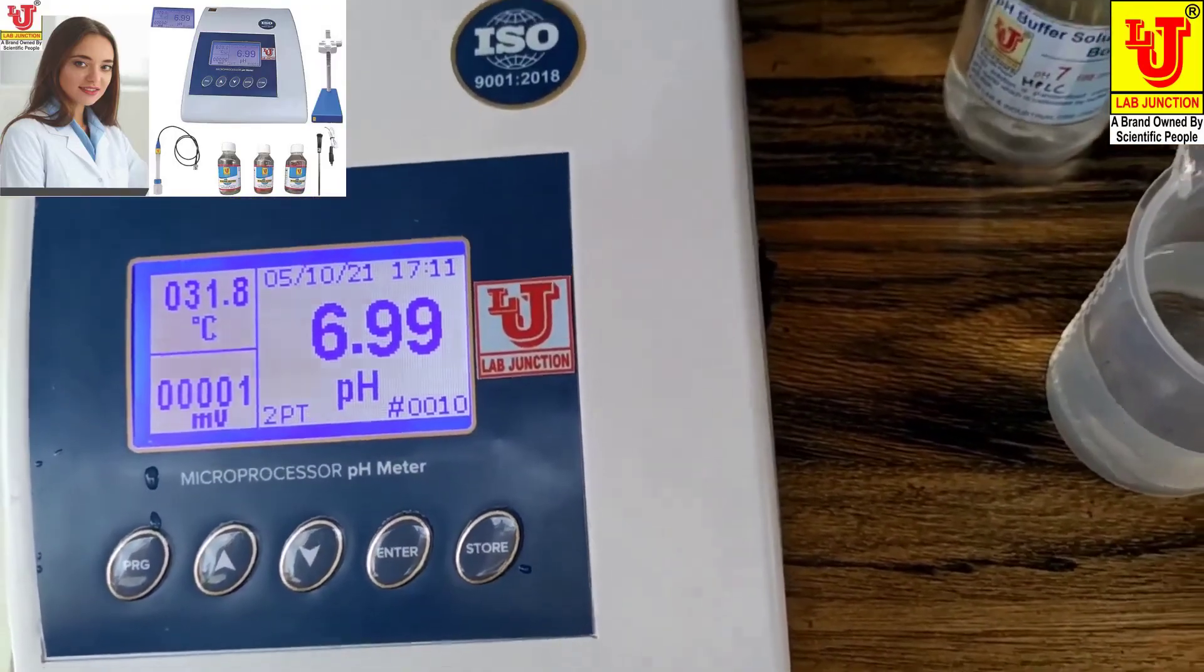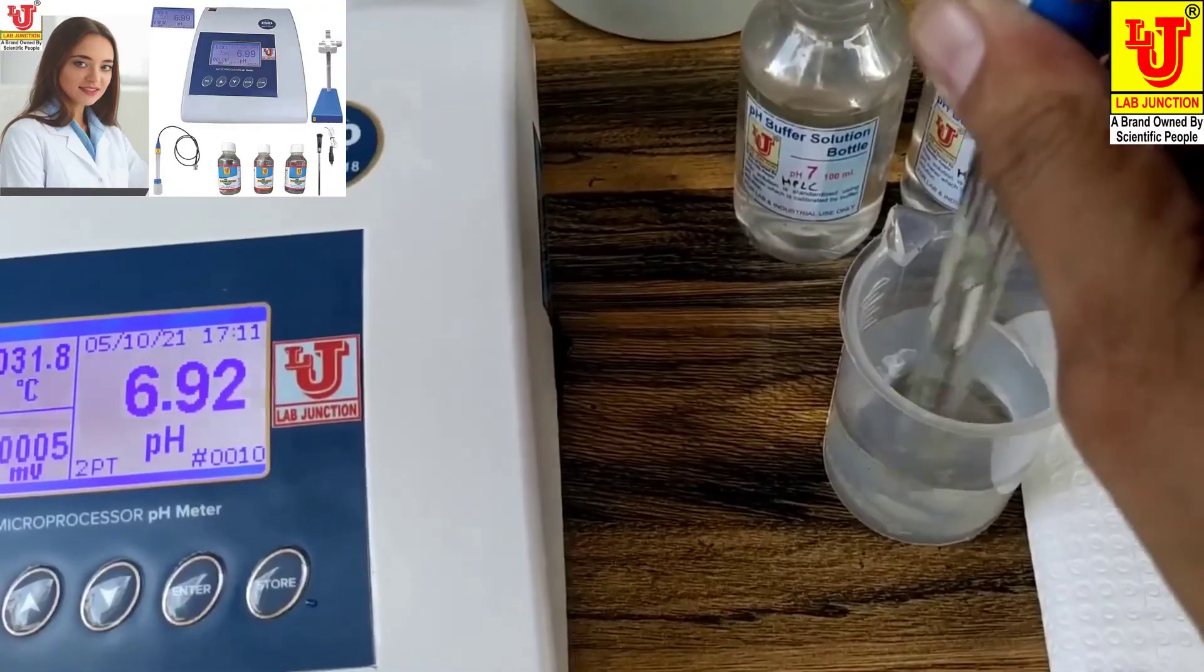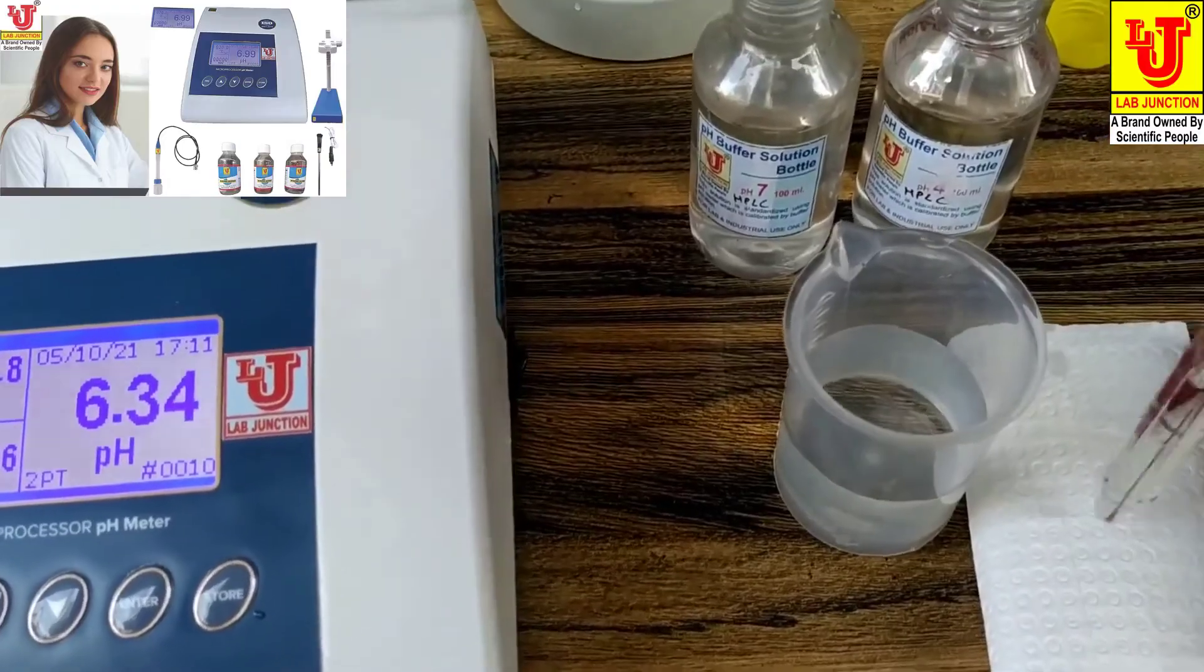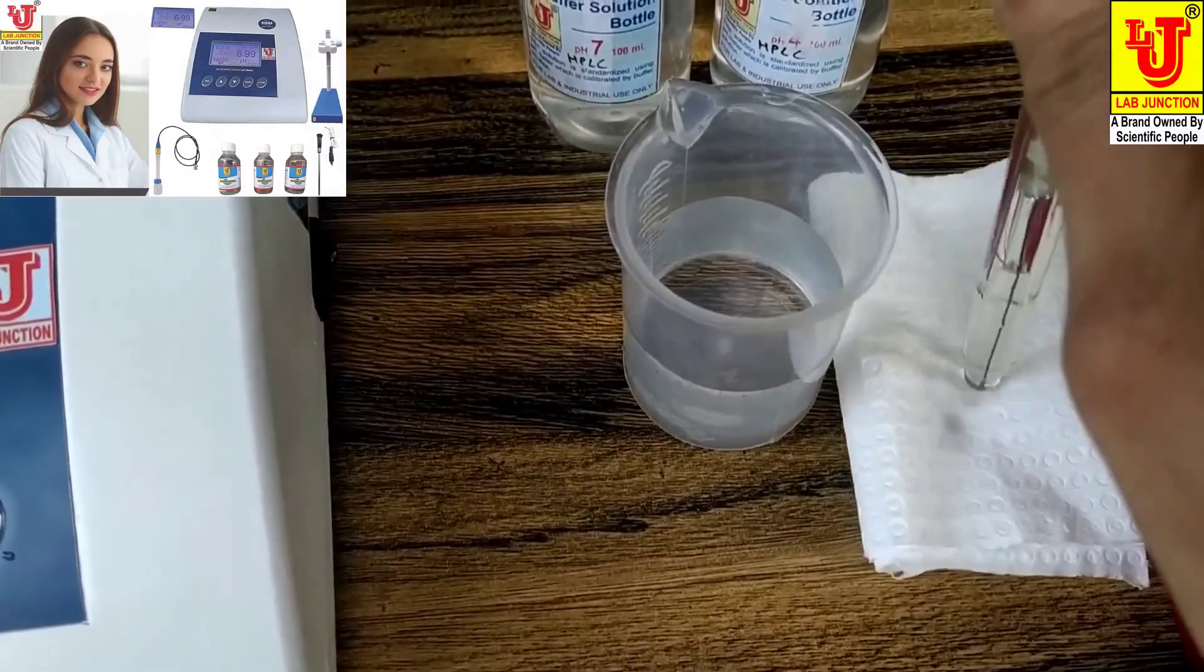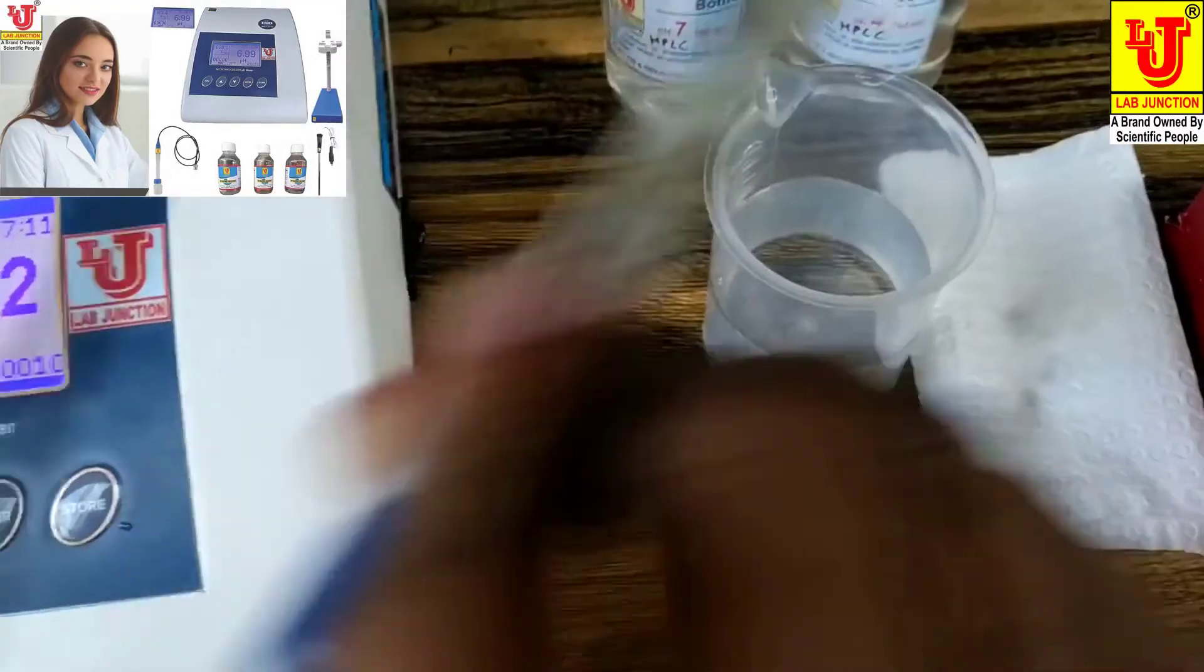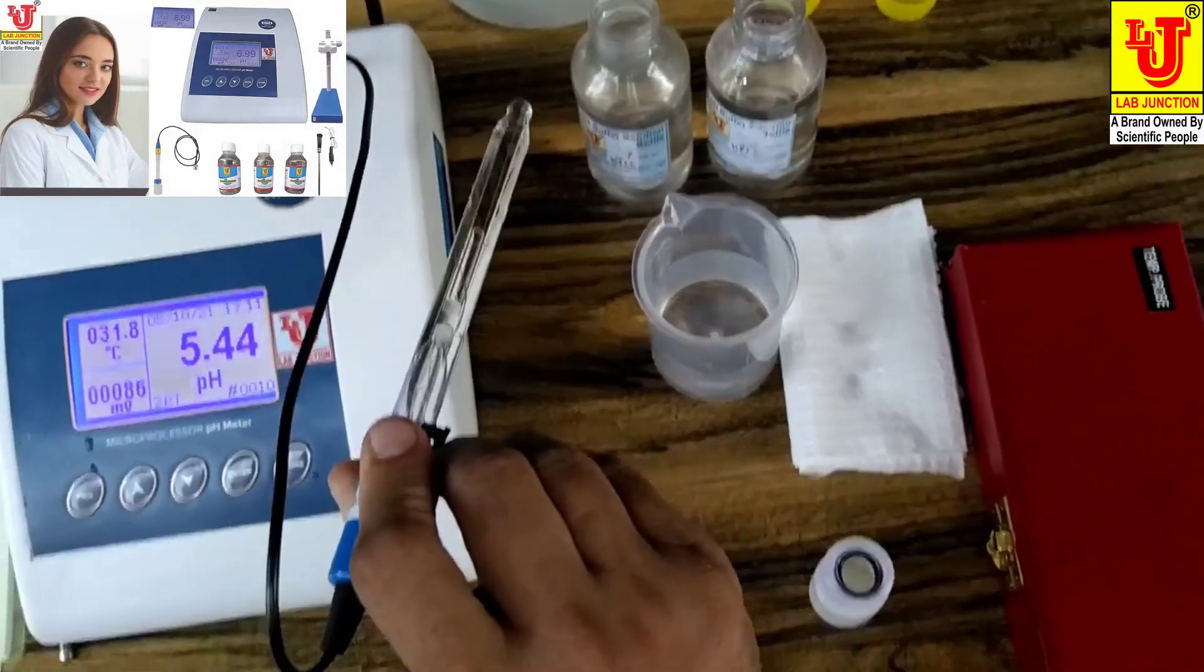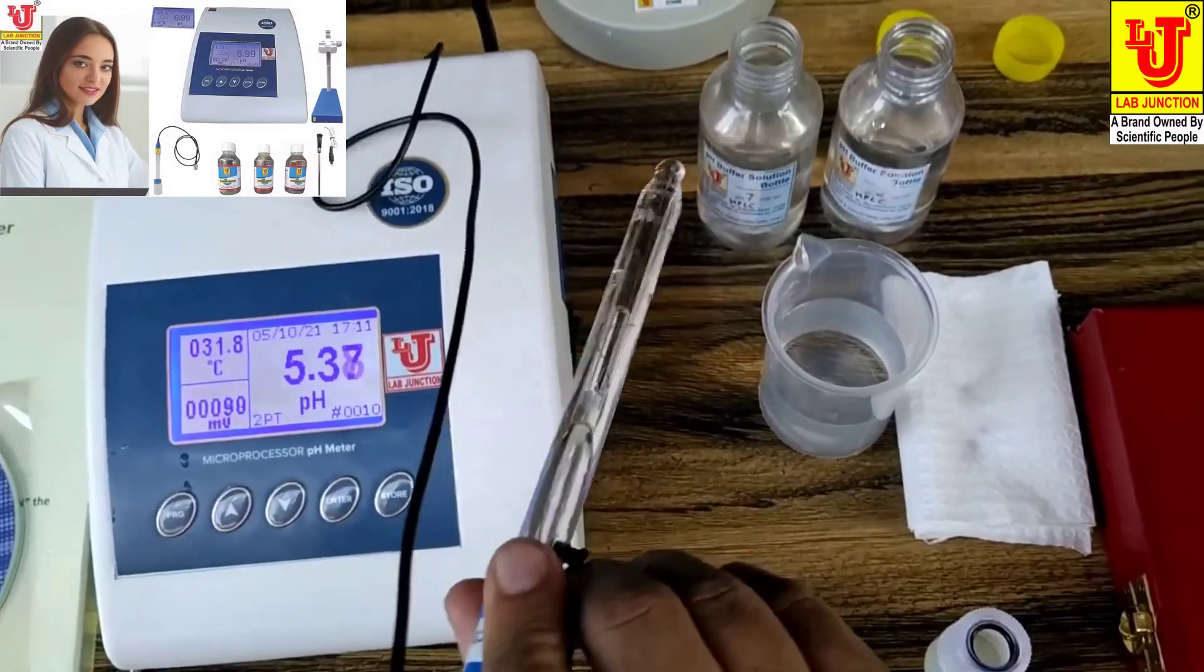When you're analyzing your sample, wash your pH electrode and refresh with tissue paper like this. No need to refresh when you dip in 7 pH or 4 pH, because buffers never contaminate.